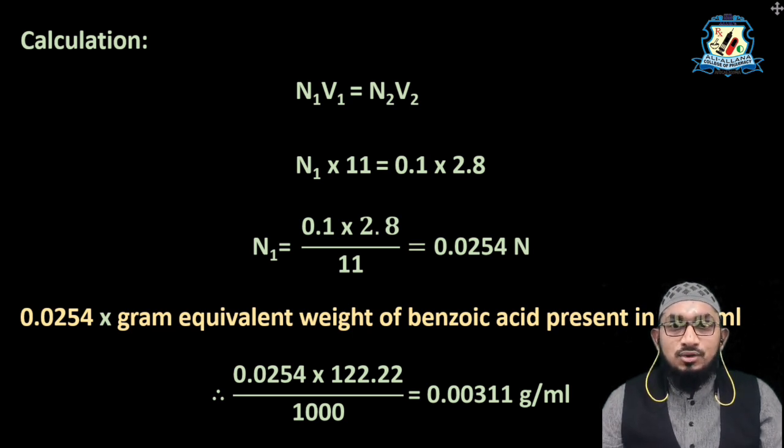This is how we can calculate the solubility of benzoic acid in water by using volumetric analysis, or we can say titrimetric analysis.